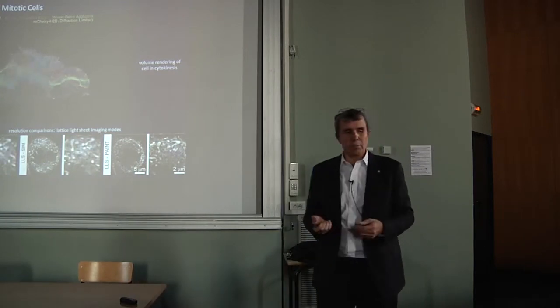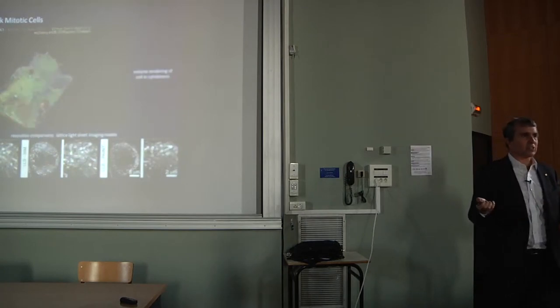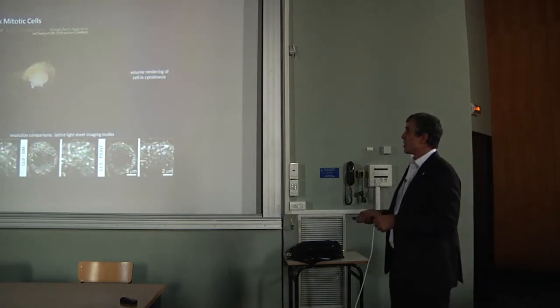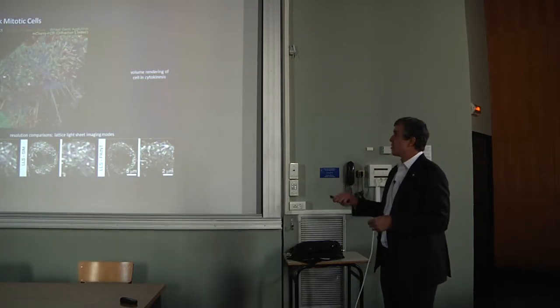The other advantage of PAINT is that we can extend this from thin samples, which is usually what super resolution is limited to, to much thicker specimens. In this case, we're looking at a whole mitotic cell in cytokinesis.